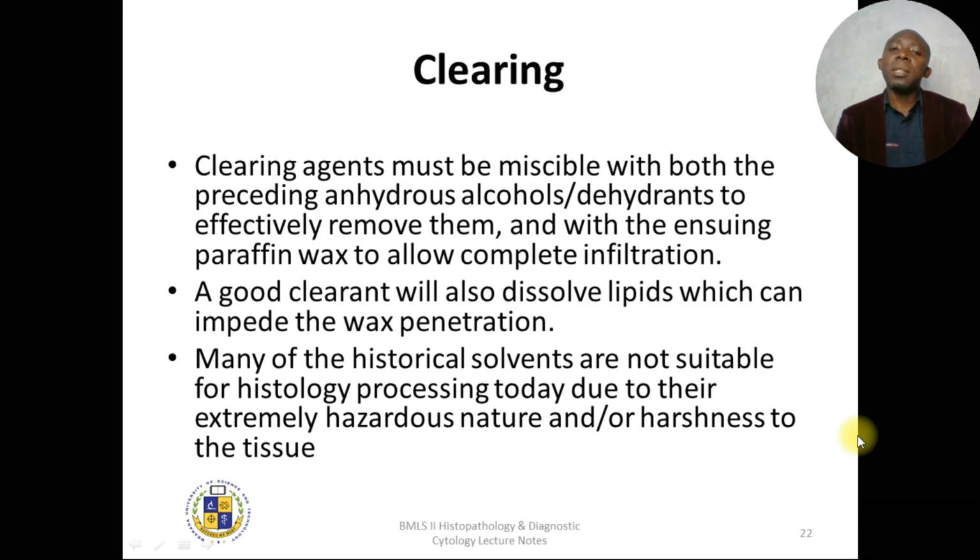Because now we want to remove the dehydrant which removes the water. The dehydrant, which was the alcohol, is also not miscible with the infiltrating substance. So for us to infiltrate the tissue well, we need now to remove the dehydrant, which is alcohol.